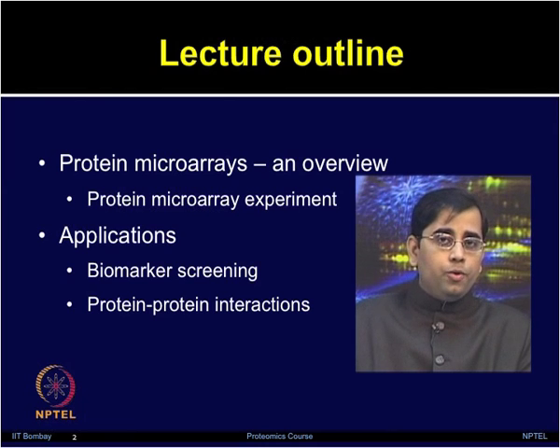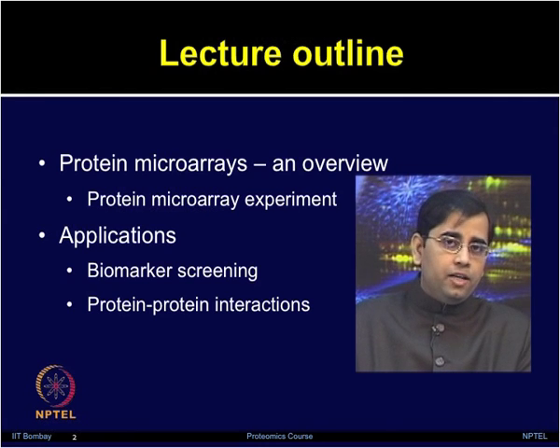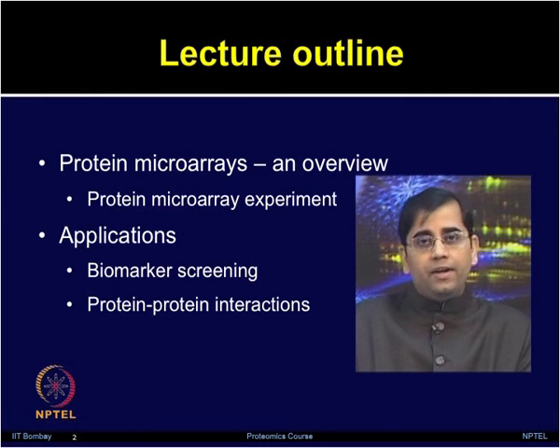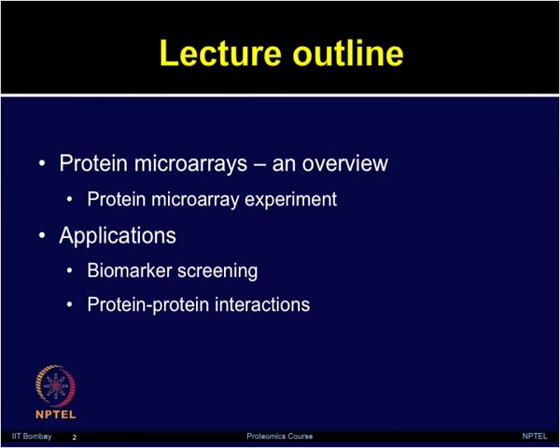After discussing the overview and the general strategies, we will then talk about different applications. I will give you case studies of biomarker identification, different types of immunoscreening, as well as protein interactions and kinase substrate identification.